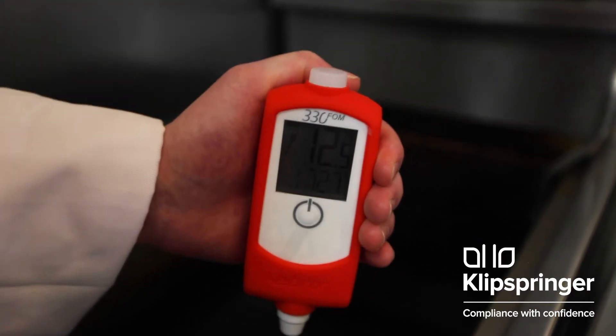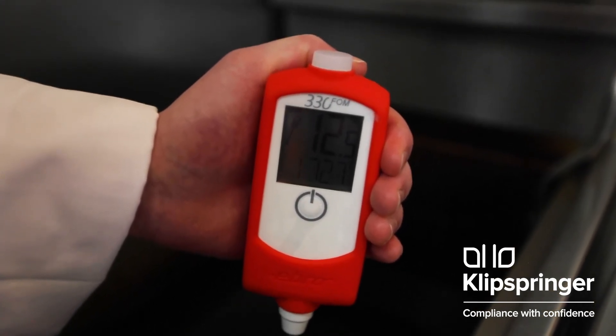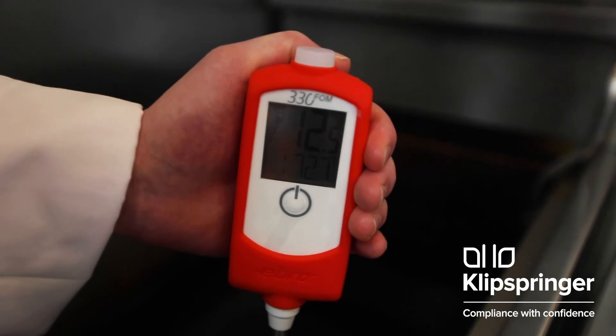The measurement has finished when the light on the top of the FOM 330 starts flashing. The top measurement on the display will also have stabilized.